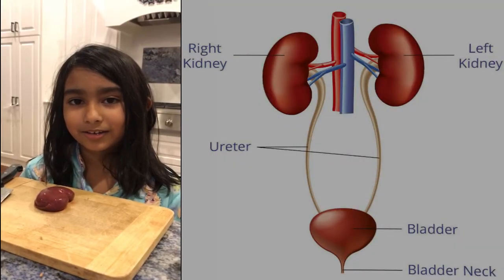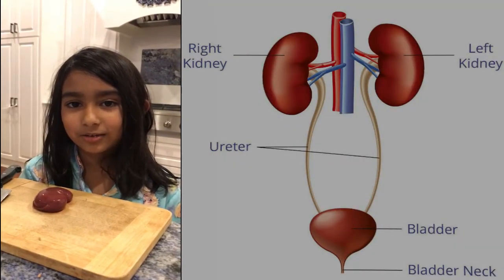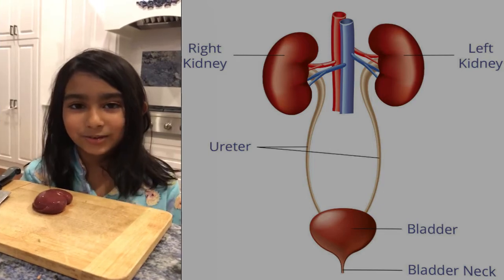My name is Hibah Ghori and I am dissecting a goat kidney. I am six years old.